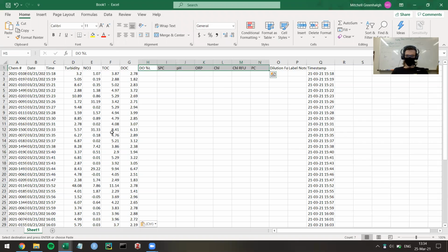And we ignored these values, so now we just have the dilution factors. Dilution factors will be recorded manually in the scan notebook. And so we are going to look to see if any of them are noted. Generally, they're not noted unless it's not 1.